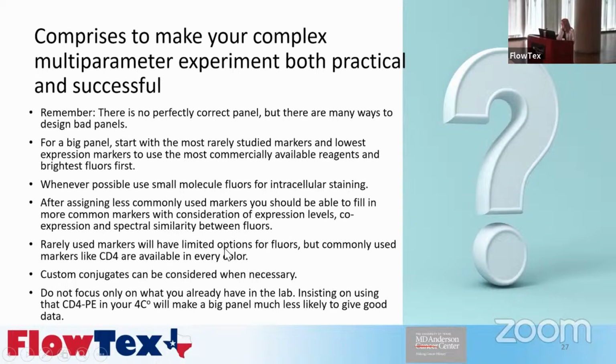So just because you have CD4 PE in your fridge does not mean that you are going to be able to use it in your 20 to 40 color panel. It just won't work. So in a lot of cases, you're going to have to go ahead and buy new reagents if you want to increase the complexity quite a lot.